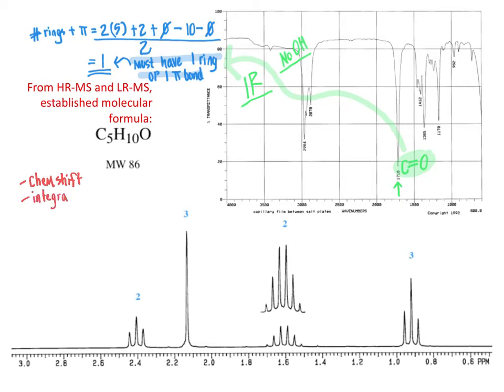That is, what is the area under the peak, because that indicates how many protons make up that signal, telling us whether it's a CH3 group integrating to 3, a CH2 group integrating to 2, or a CH group integrating to 1. And then the third piece of information is for each signal, we can look at the multiplicity or the splitting pattern. That is, how many of these little subpeaks are present within each signal, because that indicates the number of vicinal hydrogens, the number of hydrogens on the adjacent carbon, using the n+1 rule.